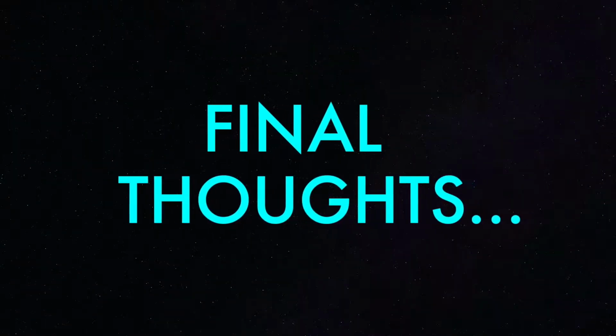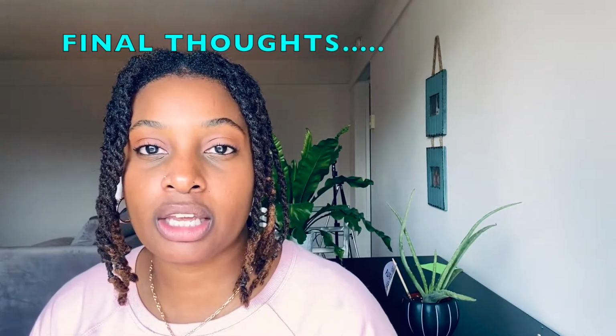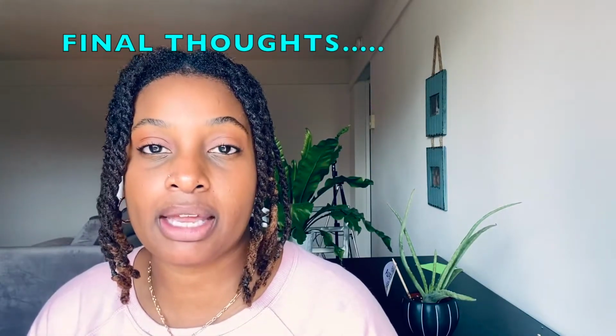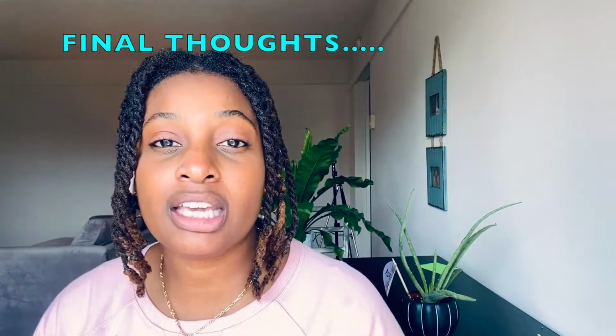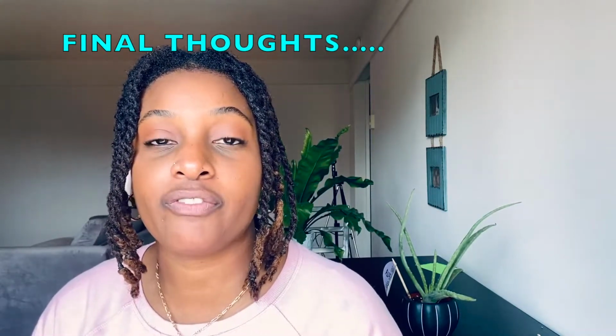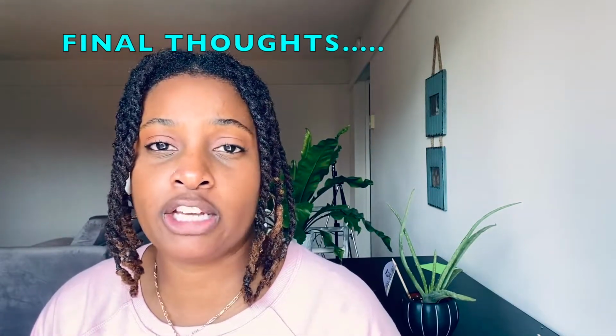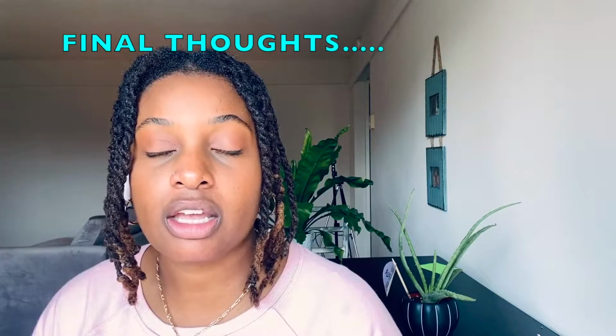All right, guys, so final thought on what to expect. My final thought for you guys and my advice for you guys while you are at your clinicals, that would be to spend as much time learning cutting and embedding. Those are really the key components when it comes to histology, probably what you'll be hired for at first in the first year or 2 of you actually being a new histotech.